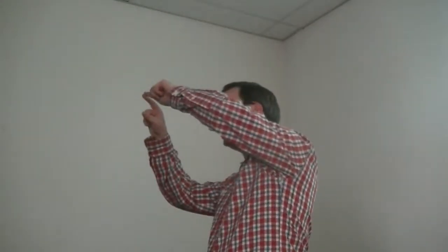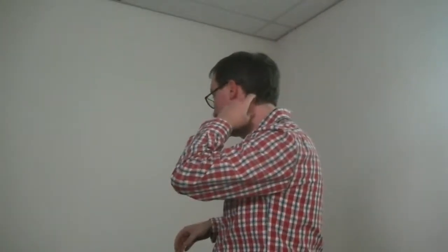But now I'm going to ask you to take the conceptual leap of saying we actually are measuring 100 or hundreds of m over z values in these metabolites. So now, instead of this nice little two-dimensional space, we have an n-dimensional space. Maybe it's hundreds of dimensions. But I'll tell you something that's kind of magical about this. Vectors in this 100-dimensional space, you can compute the angle between them in exactly the same way.